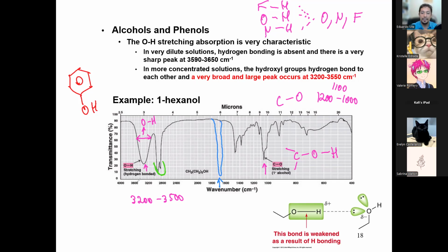Alkane, that's right. These are your stalagmites. Remember, they are always there. These are present in every spectrum right here. So these are your sp3 CH stretches, your stalagmites. Always there. You need to know that they are not something else. You cannot confuse that with another functional group, or that's how you lose points.